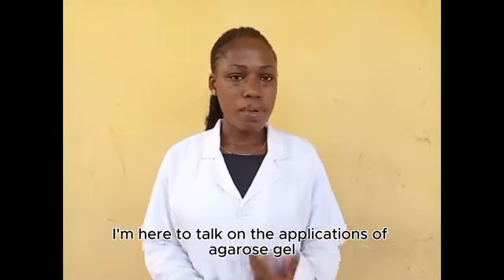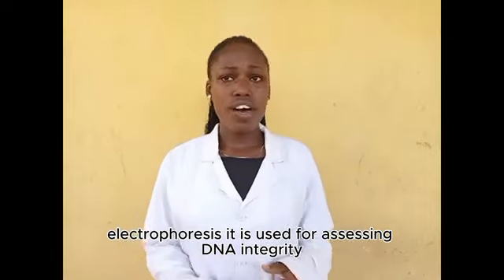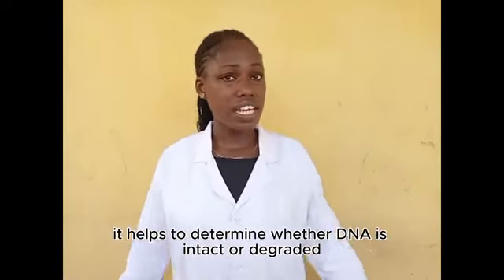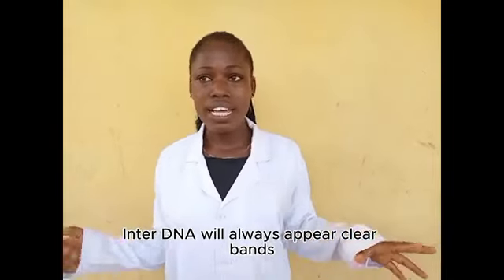My name is Matthew Hopez. I'm here to talk on the applications of agarose gel electrophoresis. It is used for assessing DNA integrity. It helps to determine whether DNA is intact or degraded. Intact DNA will always have a sharp band, while degraded DNA shows smearing.